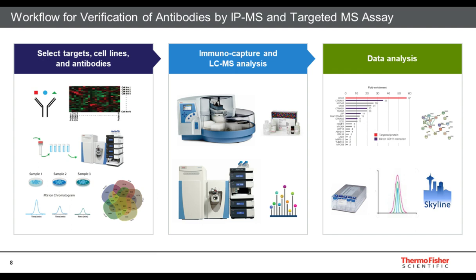And in the third step, since we are generating this directed discovery data when we verify antibodies by IP-MS, this data can be used to identify the proteotypic peptides that can be used with the targeted PRM or SRM assay using the AQUA peptide.